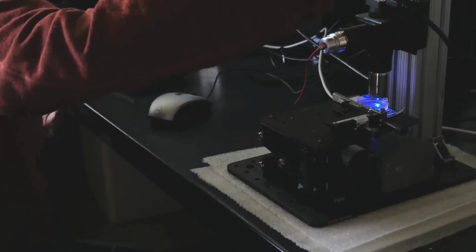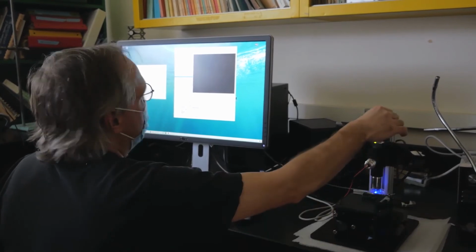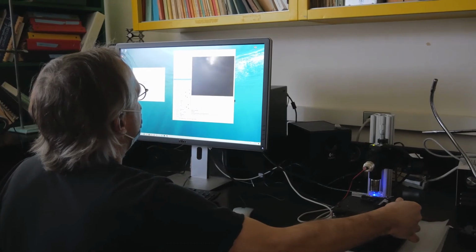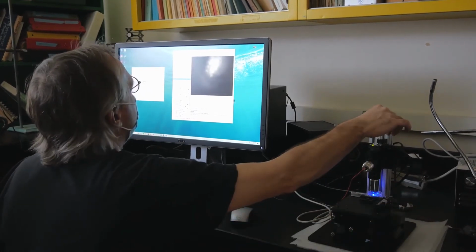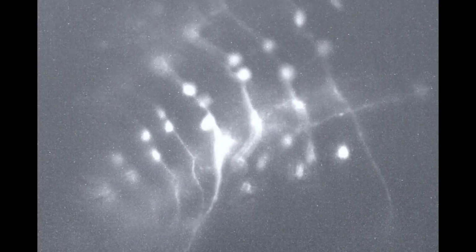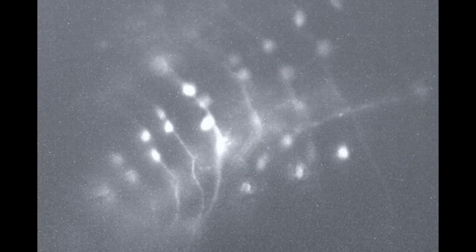And all of a sudden, one day, we had it, and we saw this pattern of neurons that were lighting up, just like in a paper we'd read, and we were like, wow, this is amazing, we did it. There are any number of techniques that we could use with this microscope, including regular epifluorescence of not just calcium imaged embryos, but all kinds of fluorescent probes and neuron tracing and so forth.